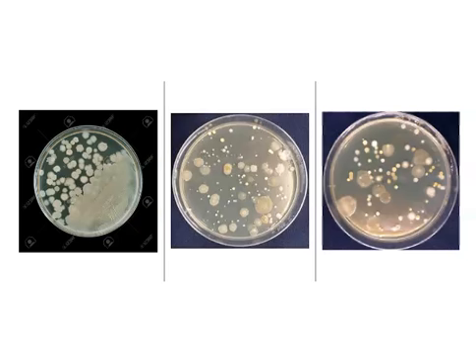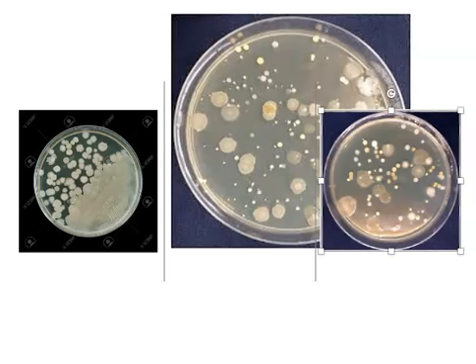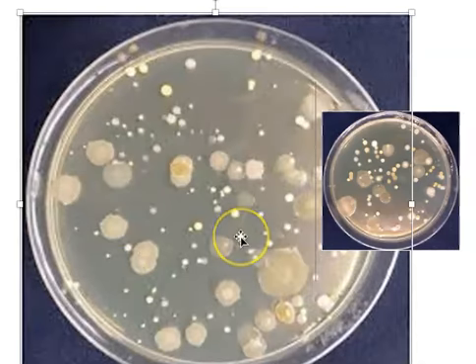In other words, there's going to be more than one type of microbe growing. So we have to be able to evaluate these dishes in terms of expecting to see multiple organisms.